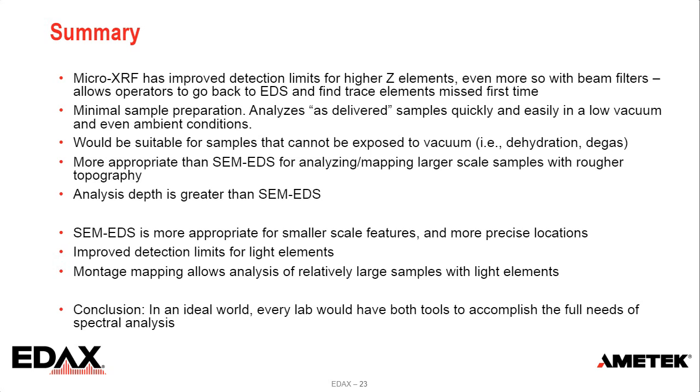Because Micro-XRF has a larger sample chamber, a large stage, and a larger spot size, it's more appropriate than SEM-EDS for analyzing and mapping larger scale samples with rougher topography. Also, analysis depth is greater than SEM-EDS because the X-ray beam is more penetrating.